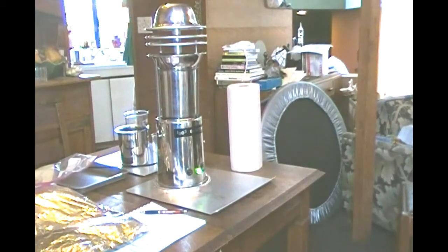After about 6 hours we can open it up and we will remove a good bit of alcohol. Once we do that, there will still be alcohol oil solution in the bottom of the processing vessel, but it will have a lot less alcohol than what is there right now.